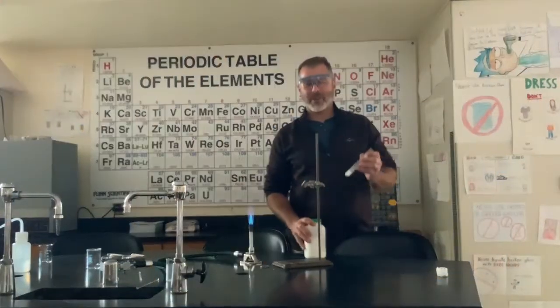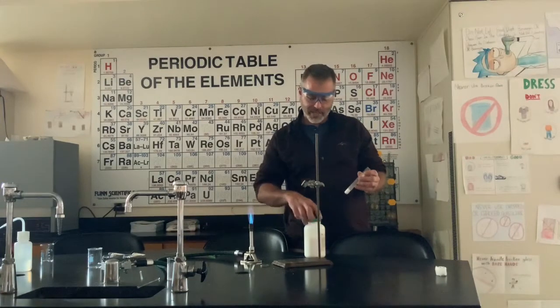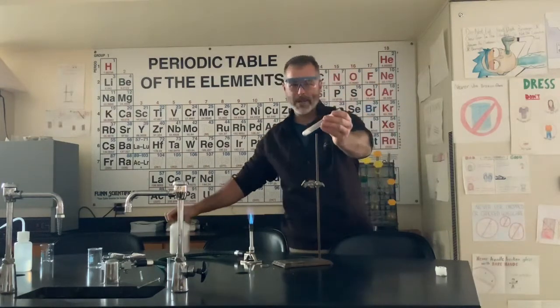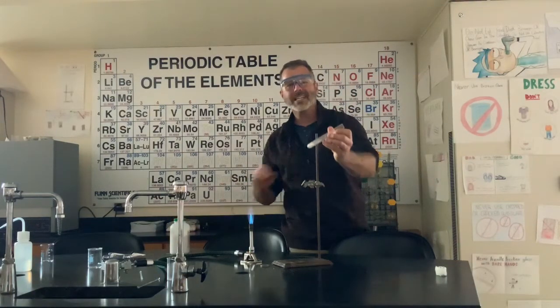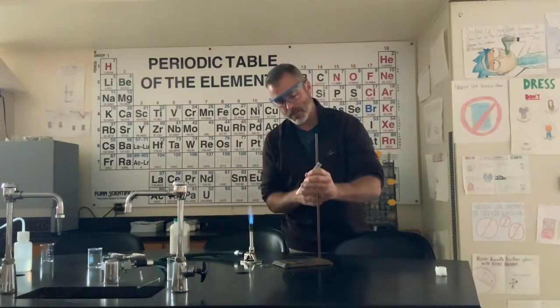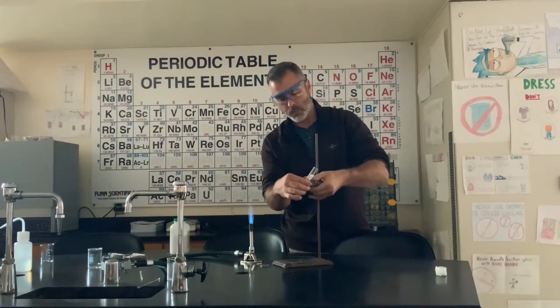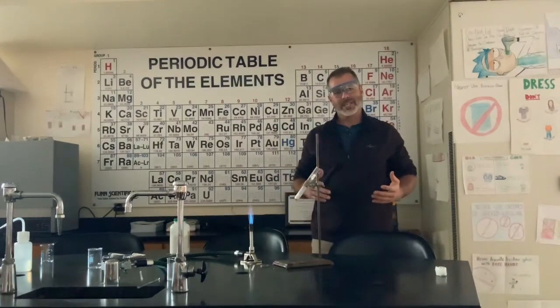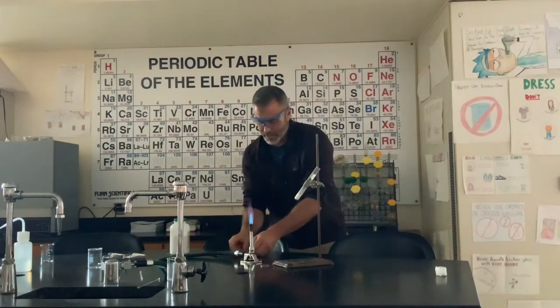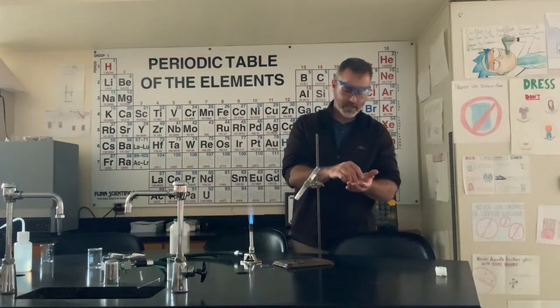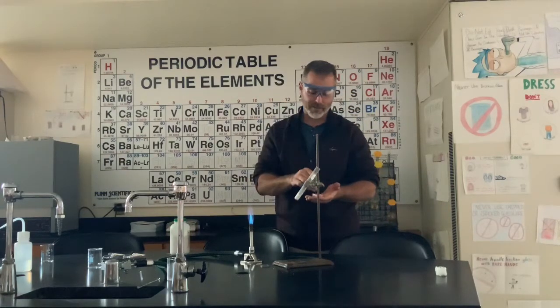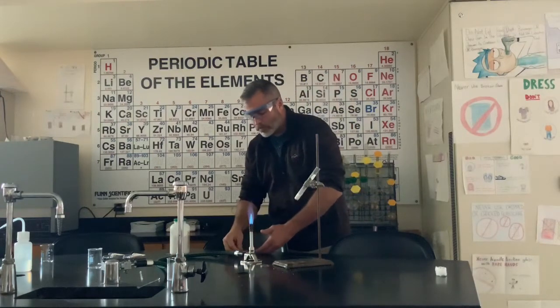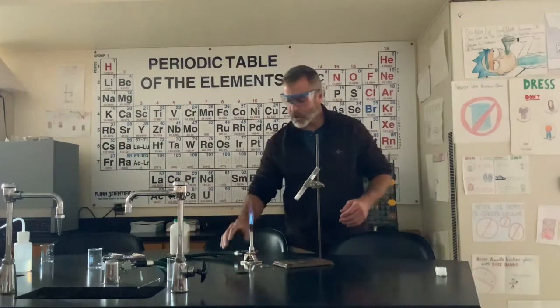Hey, we're back at you with our last demonstration of the day in the two-for-one special yet again. In this one, we have potassium chlorate. Awesome stuff. It's in this tube. It's a white powder. And we're going to decompose it. When we decompose it, we're going to make two different products. One of the products being potassium chloride. The other one being a gas that we're going to use for our second part of this reaction. In the second part of this reaction, I'm going to take some of these Smarties. If you don't believe me, look, they're real. Smarties. Pretty delicious. Just had Halloween. Kids didn't like them, so I took them. For my own kids, not little kids on the street. Anyway, I just wanted to clarify.